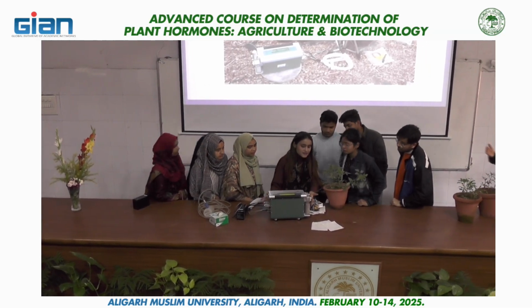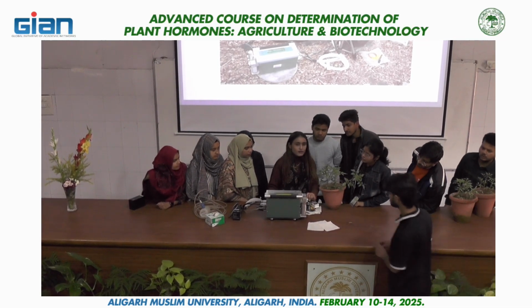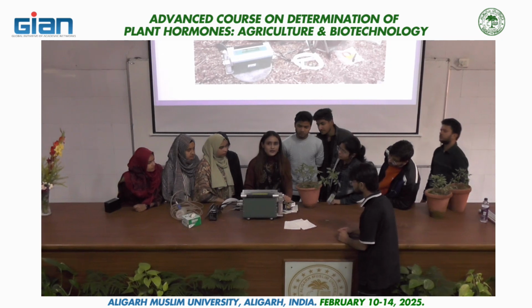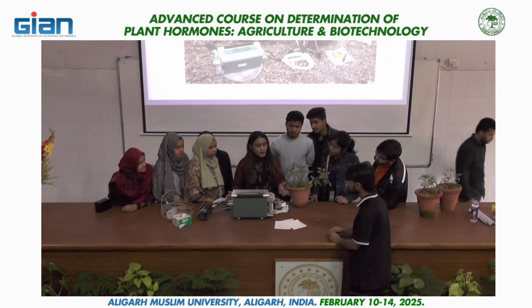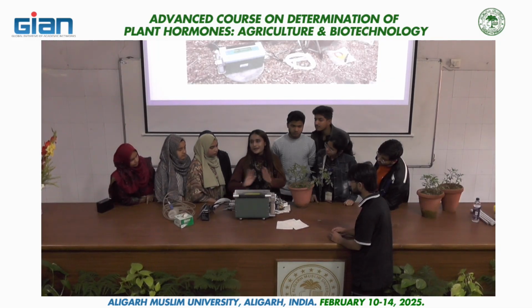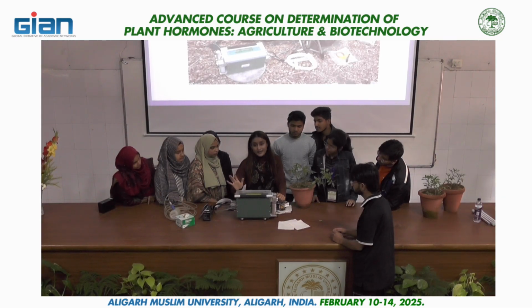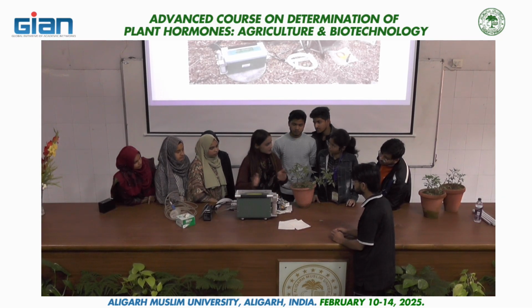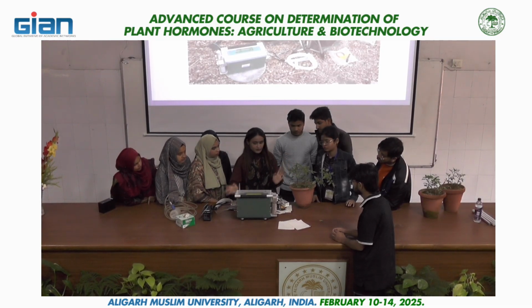Okay, fine. These are basically the bypass scrub. This one is for reference, and this one is for sample. You should never touch it because it is already calibrated. If you move it or roll it, then readings will get hampered or interfered. As it is calibrated, you should not touch it. You just have to operate here. You should measure readings here only.